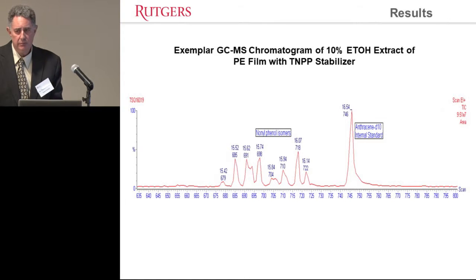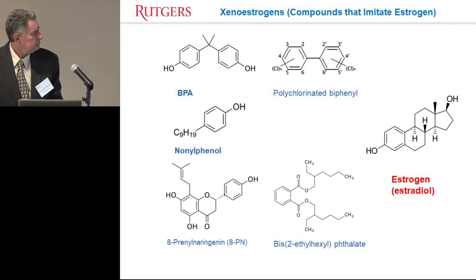Here's a PE film that I just ran last week that had TNPP in it, and you always see these nonyl phenols right before the internal standard comes out. And we'll skip this. This just talks about endocrine disruption, but we have an excellent presentation coming up later today about it.